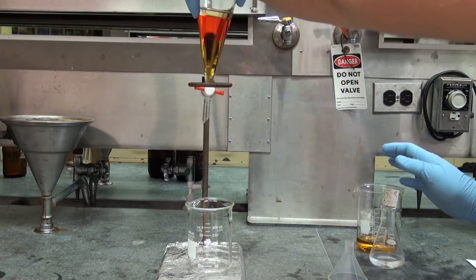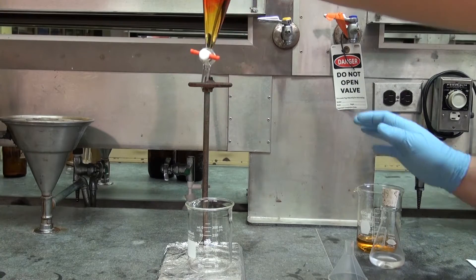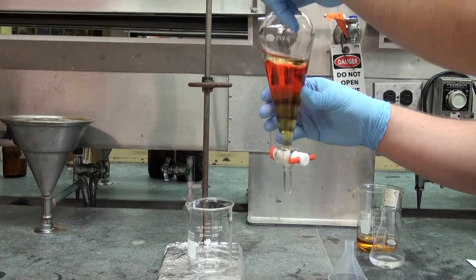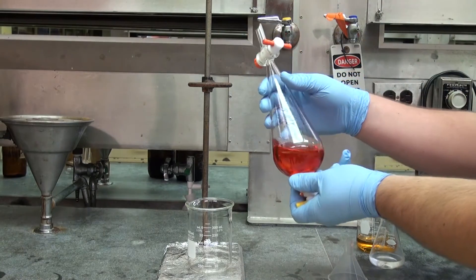Take the separatory funnel out of the ring and secure the lid with one hand. Turn the separatory funnel around.